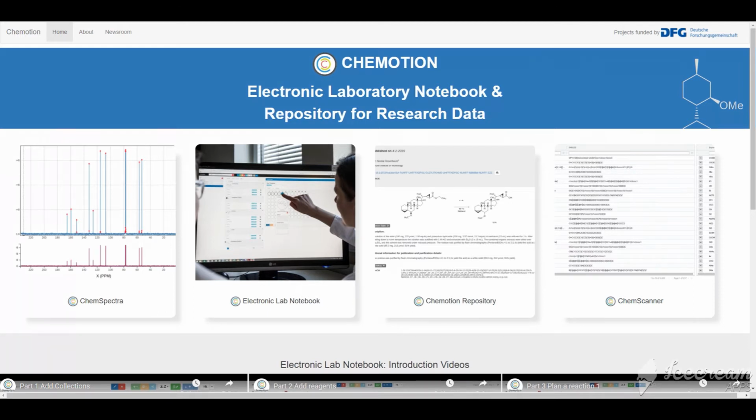And over the next few minutes, I will be introducing the Chemotion ELN to you. Before we start, let's quickly take a look at the chemotion.net webpage. This is the official webpage of the Chemotion project. And here you will find more information. I invite you to take a look at it after the video.